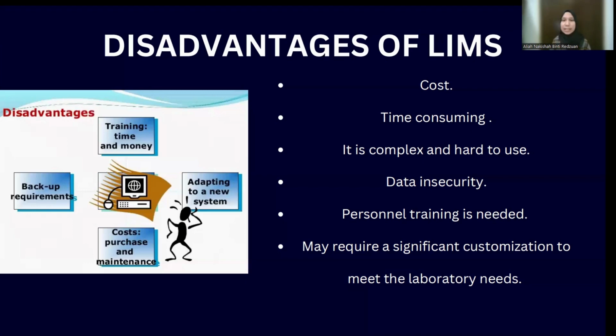And then the next disadvantage would be data insecurity. Even though the data is accurate, it can be vulnerable to cyber attacks and also threats. So to ensure secure data, it needs constant monitoring, which can be time consuming as well. That's why I said it is kind of related to each other.